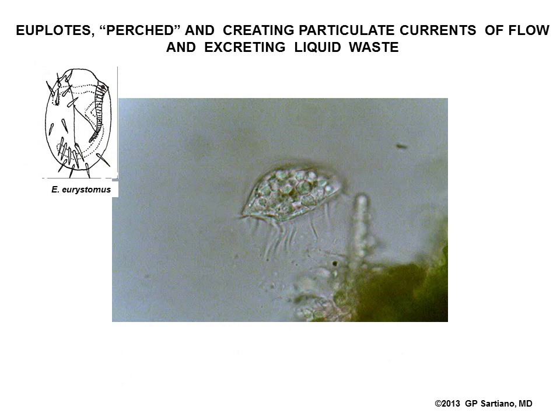Here in this lateral view, Euplotes is perched, hanging by its anterior cirri on a local piece of vegetable matter.